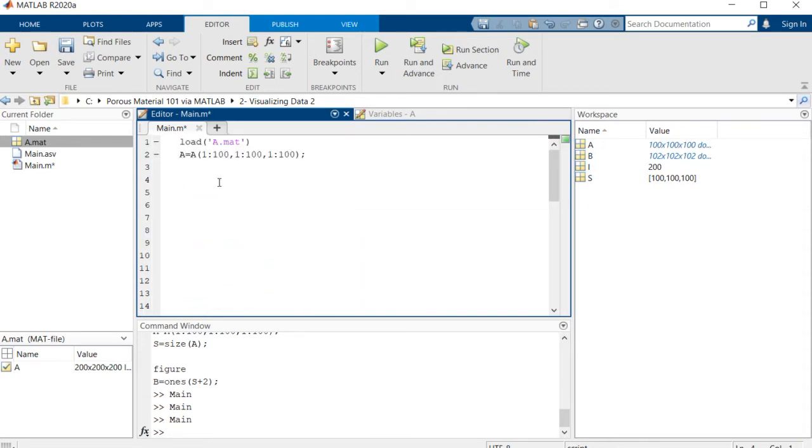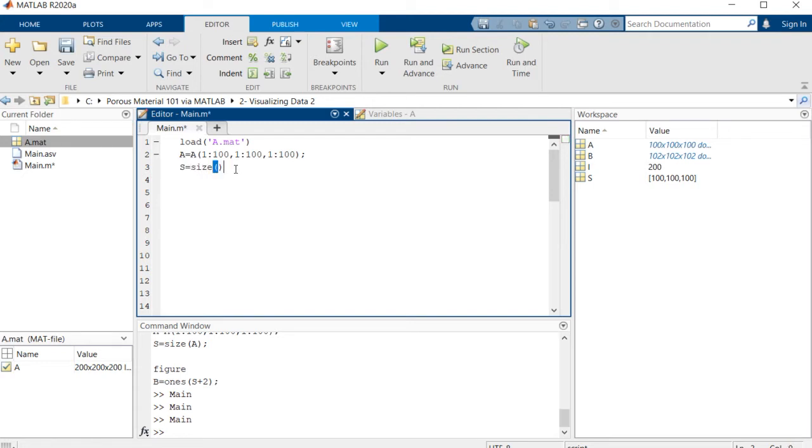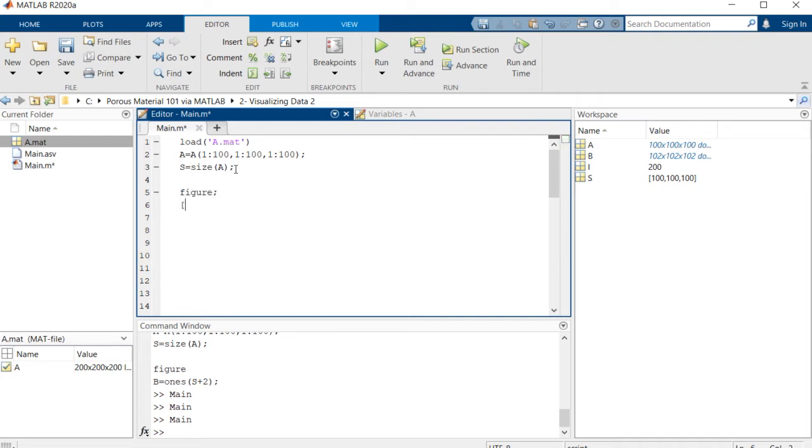I will comment out the sections. Here we have loaded the a matrix and we have cropped a part of it. We wanted to visualize only the surface of it. This is how we're going to do it. s is equal to size of a.